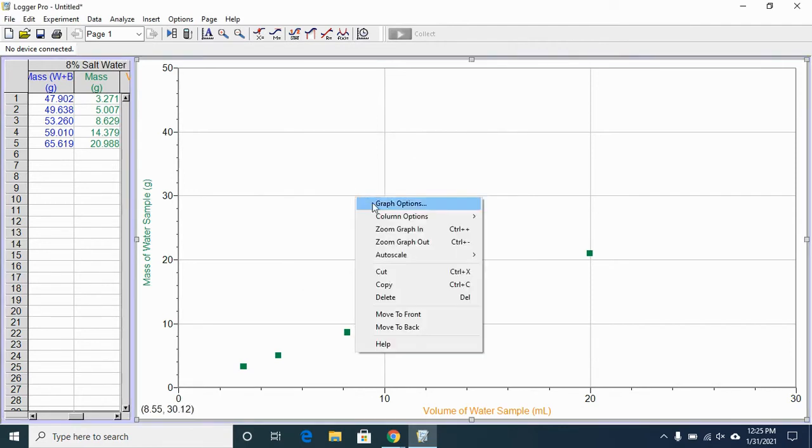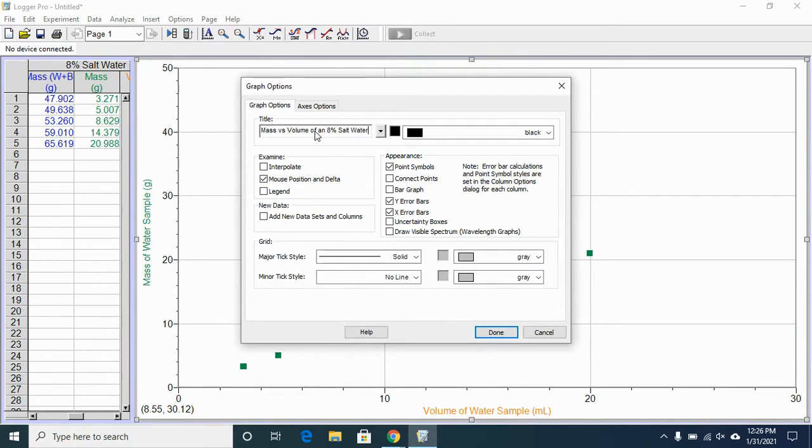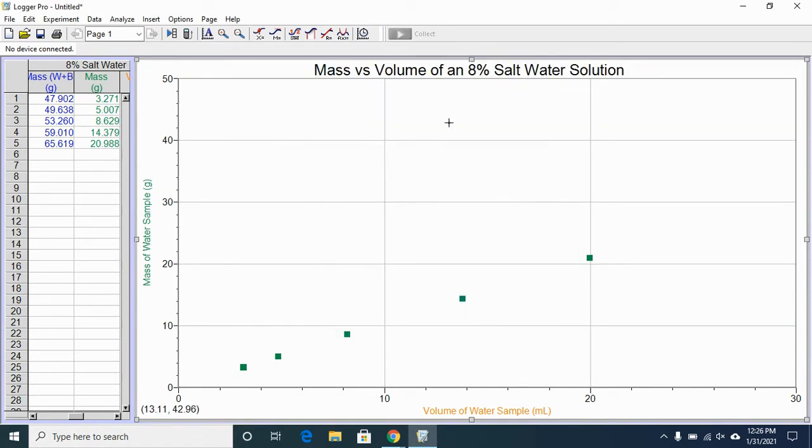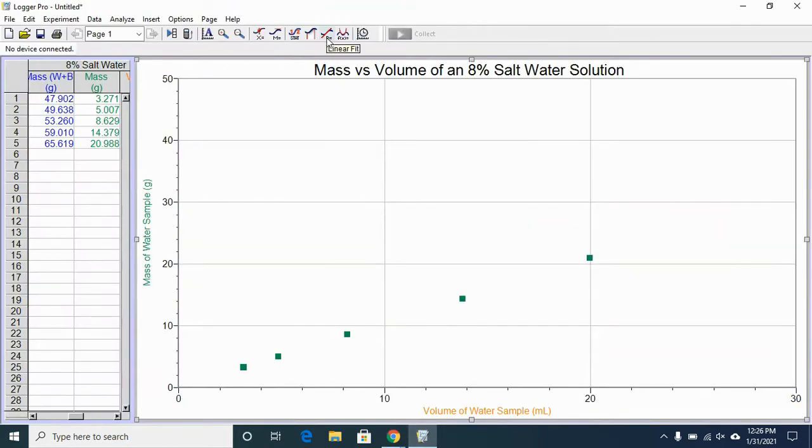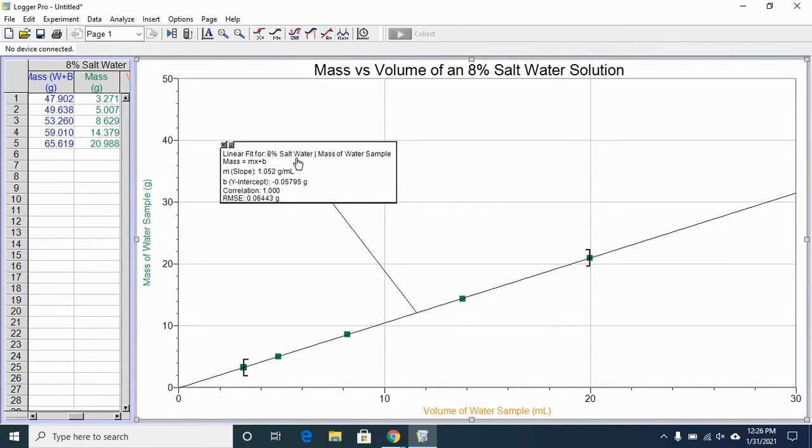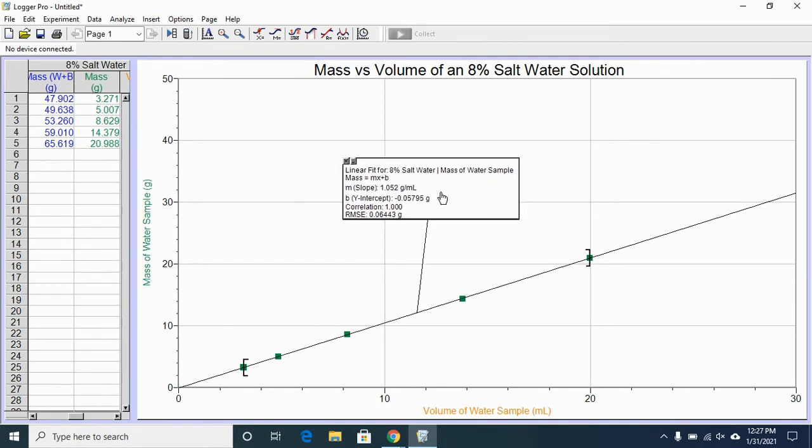Name the data set. And a title that expresses what the variables are being graphed. Let's go back and check how we're doing on the steps. The linear regression is here. Up at the r equals, it's a linear fit. My correlation is 1.000, which means that I did a great job measuring. It's a perfect correlation. This is exactly a straight line. The slope is 1.052. And it tells me because I put in the units before that it's grams per milliliter. This is the format that it's giving me this equation in, where y equals mx plus b, where m, the slope, is this, and b, the y-intercept, is this. You can move this around if it shows up in a place that's blocking things.